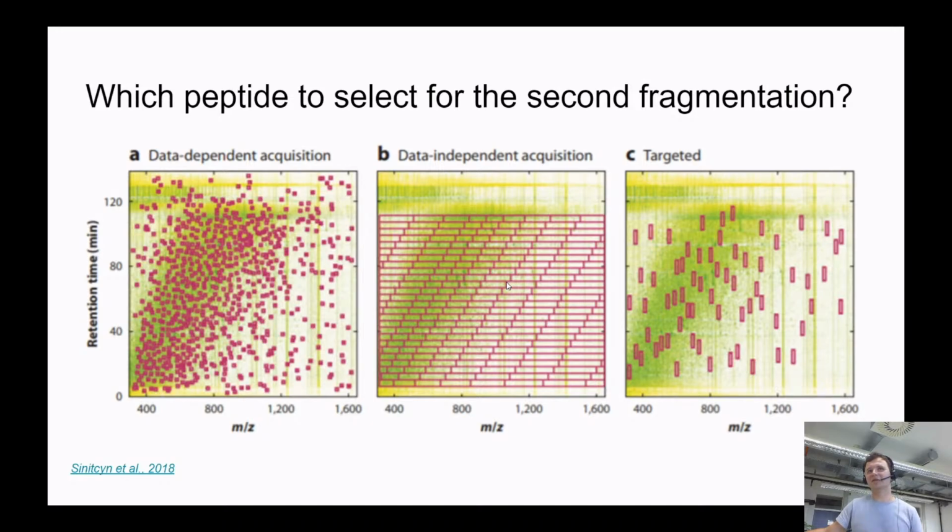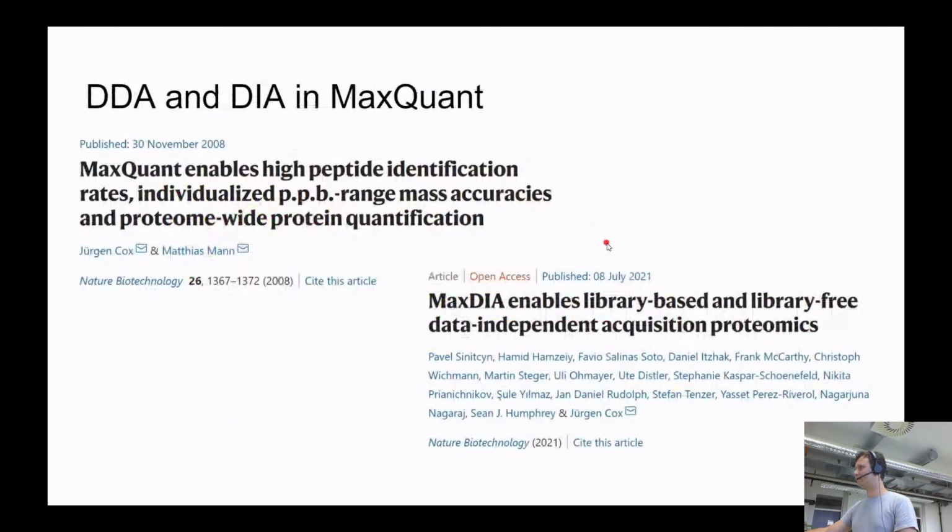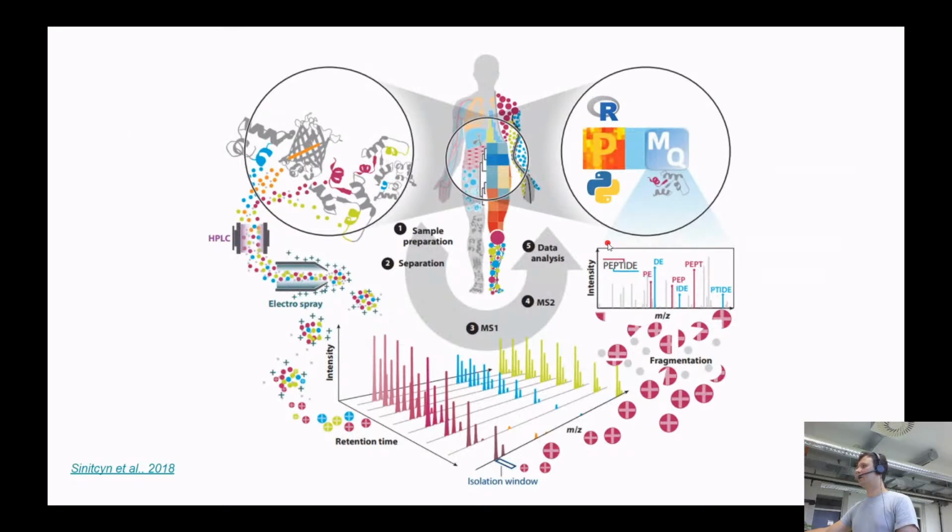It means that this data has the capability of data mining. You can really find certain peptides, certain peaks, which you were not able to describe before, and find some quantitative values there. Okay, cool. That's how our picture looks. So that's what we're doing in MaxQuant.